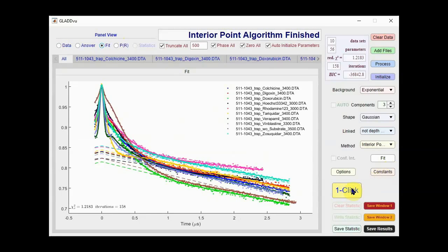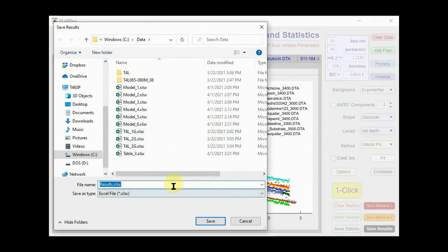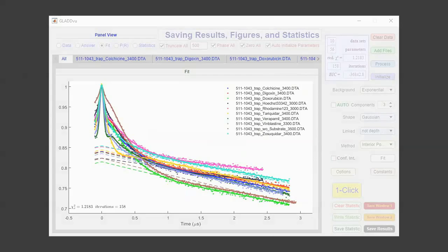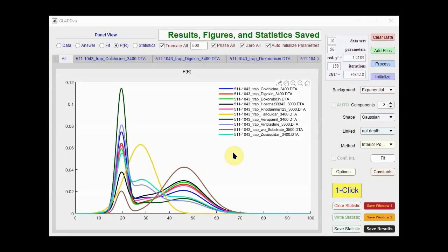And at a number of points throughout this particular video, I will pause the recording because some of these operations, 10 data sets, a large number of parameters, will take a long time. So I'm going to save this as PGP_model_1, and I'll pause the video. So we finished saving that model number 1 for the PGP data.